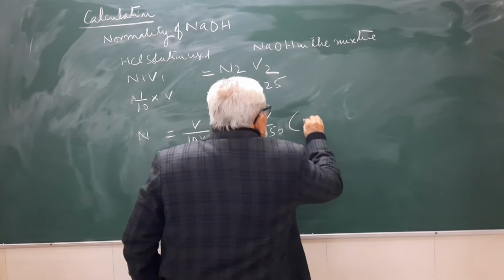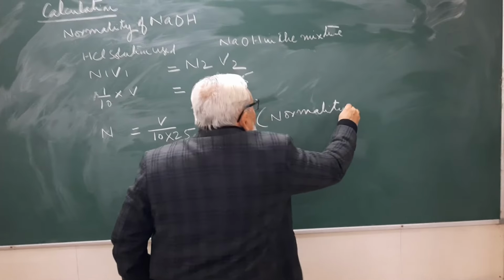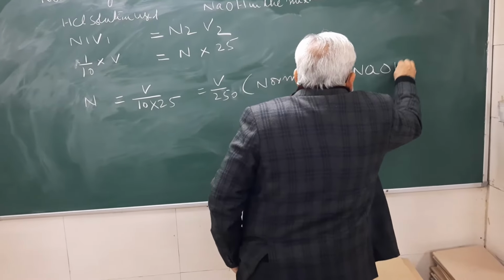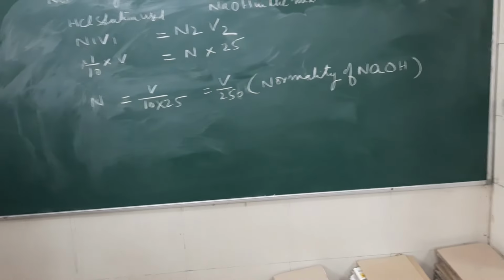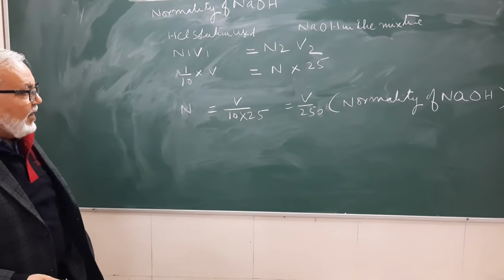This is the normality of NaOH. By this we can calculate the amount of NaOH.